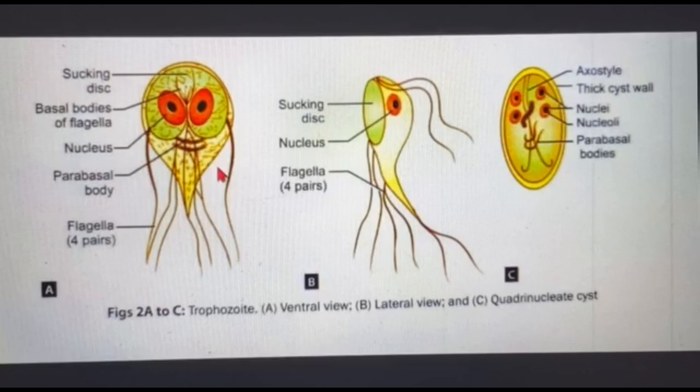If you see in the lateral view, there is a sucking disc. Now this protozoan uses this sucking disc to get attached to the intestinal mucosa. And also one unique point about Giardia is this is the only protozoan that is found in small intestine. The other ones reside in the large intestine.